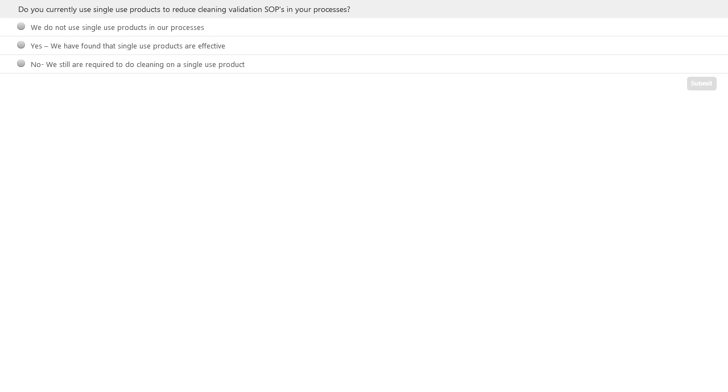Scott, is there anything you want to elaborate on about this question? It's an interesting one, and it's always decided company by company in the quality department: how to do or when to apply single-use products, and then how to look at cleaning. Is that decontamination for removal? Is it complete cleaning and so forth? We do see a range of strategies implemented by the quality departments of different companies. So it really gets to be an education on how each process and each company looks at the implementation of single-use products with respect to cleaning.